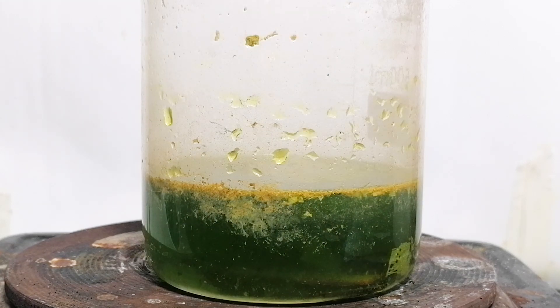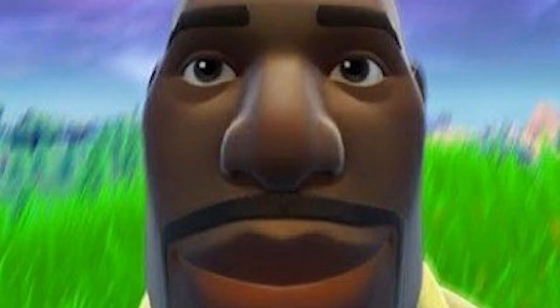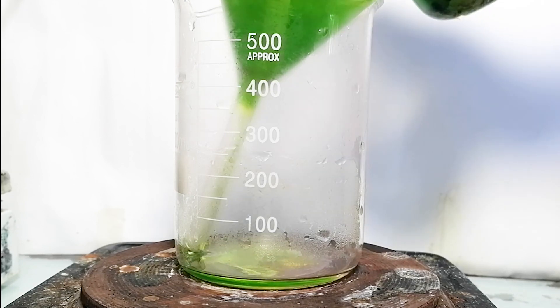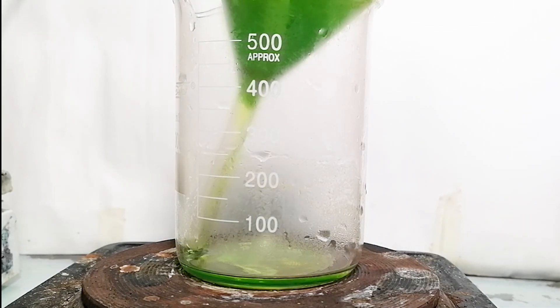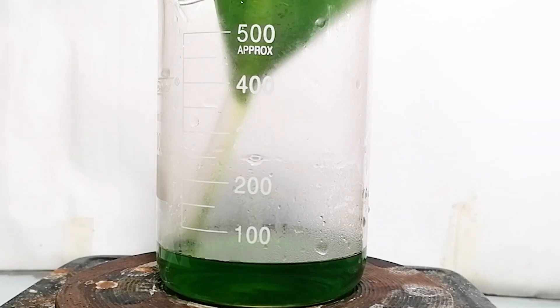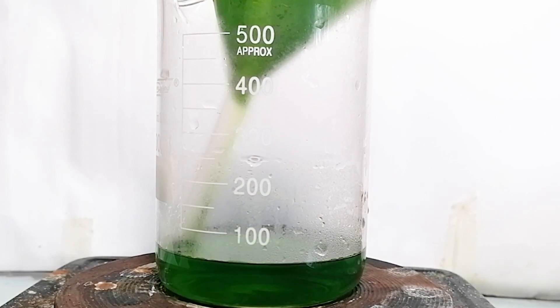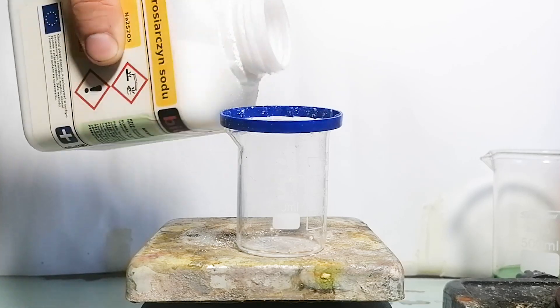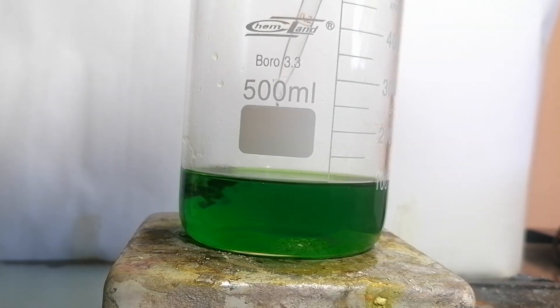With that being said, I turned on the heating and waited for it to dissolve. Meanwhile I went to play some Fortnite. Now that the gold is in the solution, all we have to do is separate the liquid out of the solid, and for that I've set up a simple gravity filtration. The filter paper was washed with water to recover as much gold as possible. So now that we have a clear solution, let's precipitate out the gold. To do that, I made a sodium metabisulfite solution and added it to the liquid.